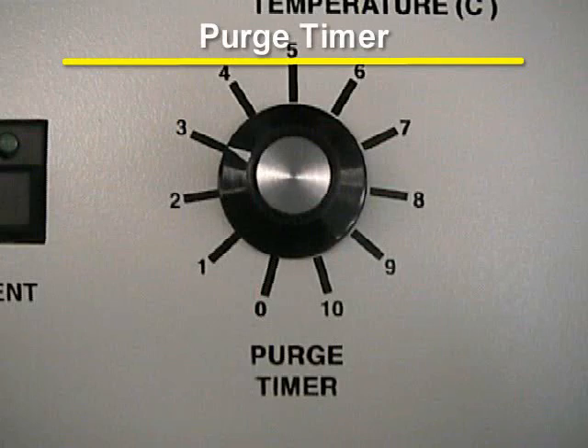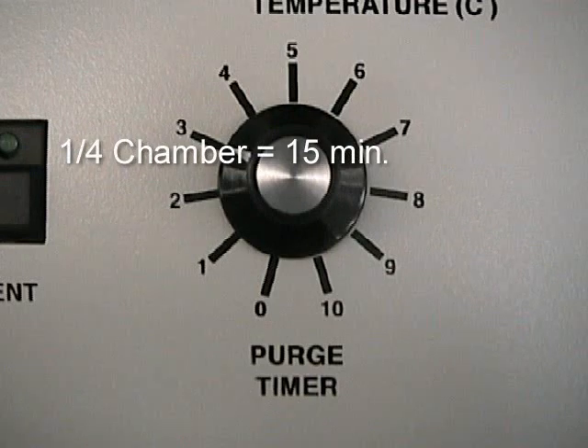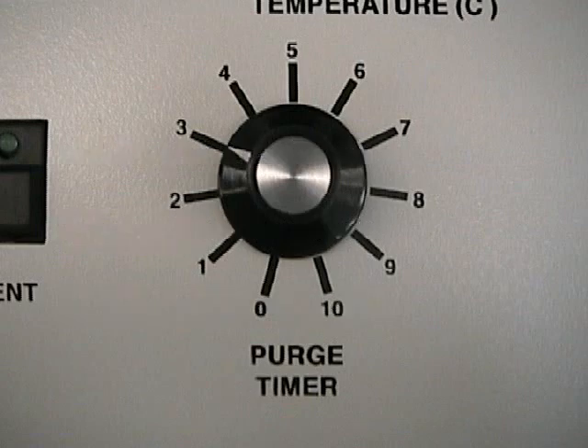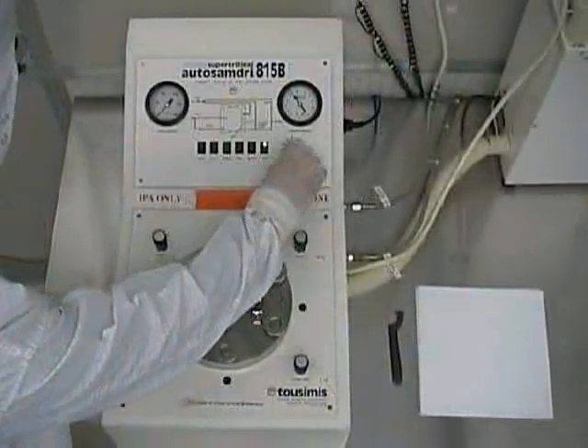Once the chamber lid is properly secured, you should set the purge timer, which is located to the right of the push button switches. Each position on the purge timer is calibrated at five-minute intervals. The general rule of thumb is: for a quarter chamber full of alcohol, use a 15-minute purge time; for a half chamber, 20 minutes; for three-quarters full, use a 25-minute purge time. Note that the actual purge time can vary depending on your sample in combination with the fill and purge metering valve adjust positions.